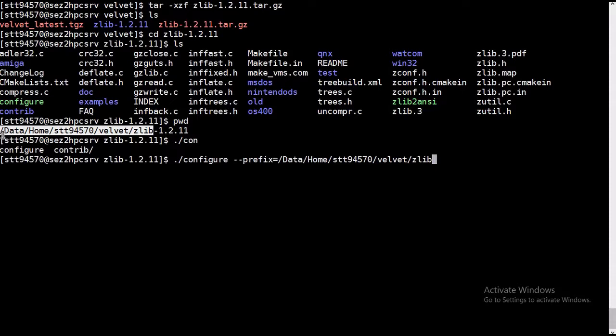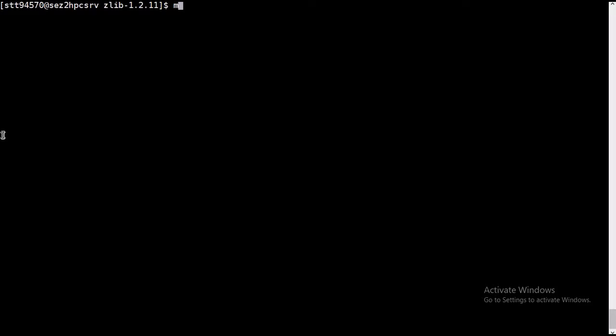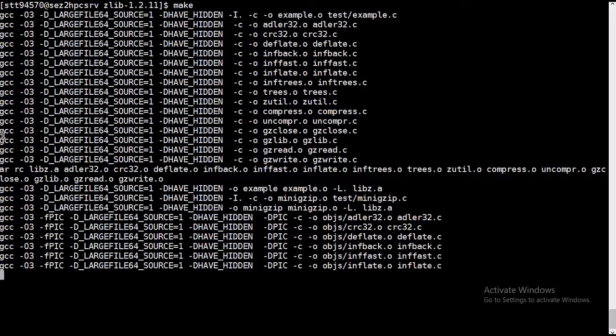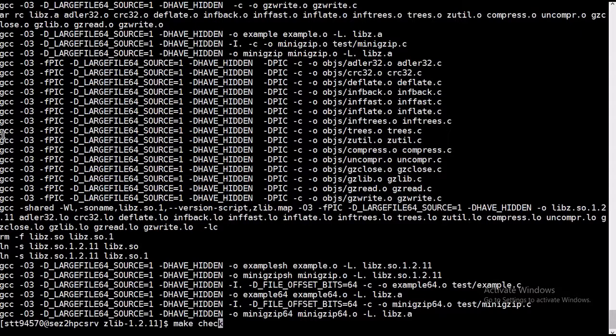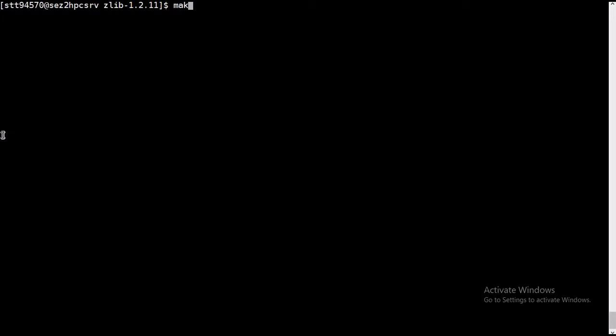This is configured. Now we need to do make and make check. So it's done, make check. It's okay, now we'll do make install.